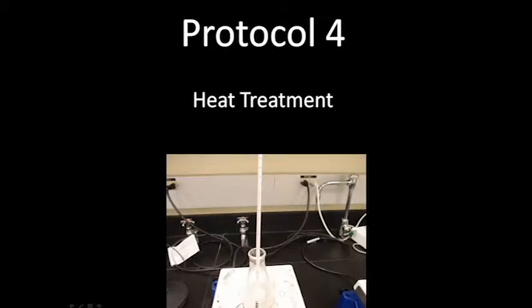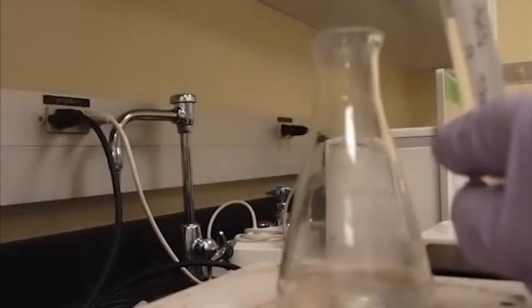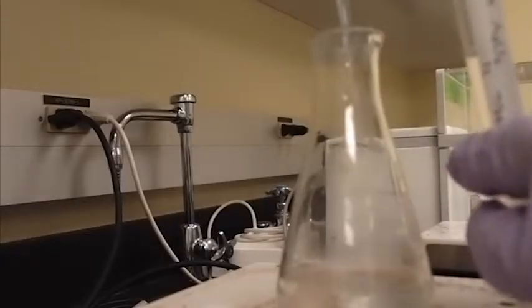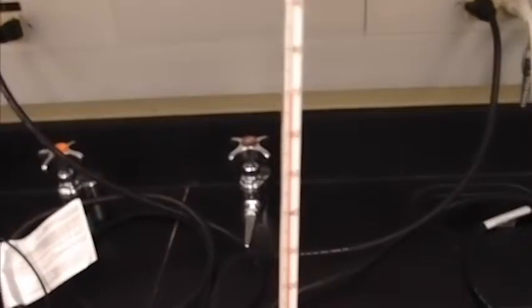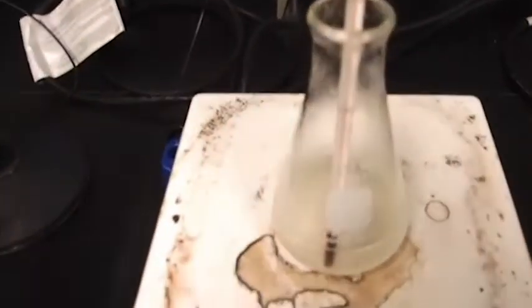The fourth protocol, heat treatment, is similar to the last protocol. Instead of EDTA, magnesium chloride salt is added to the water. The cells are heated for 90 minutes to facilitate the dissolving of PIA.